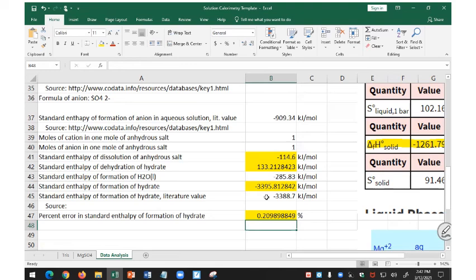Huh? That was your group? No, I was using Jasmine's numbers here. No, you're in the same group? Well, no, they had the glare, so they had to. Oh, they're using your, okay. Yeah, our video was 0.2% error. Well, you have research grade equipment there. It's old, but it's research grade, so.